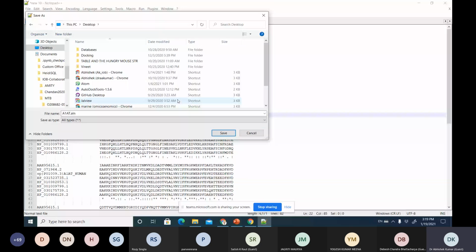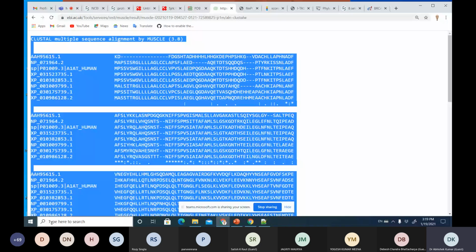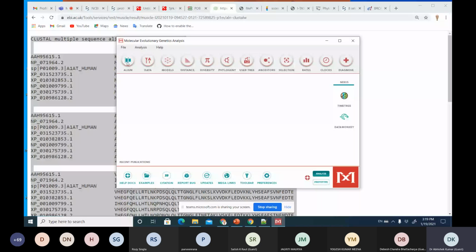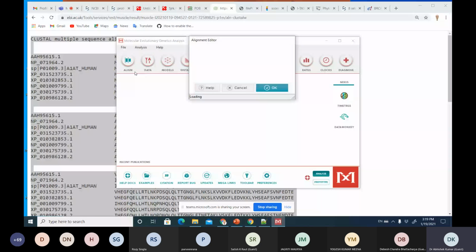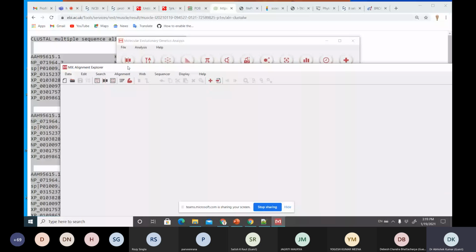And now what we need to do is to find that tool called MEGA. Muscle, we have already done it. Okay, so let alignment be. So I want to build alignment from edit or build the alignment. Okay, let me open like this first. Okay, so I just missed something. I double click it actually. So it was asking a question.